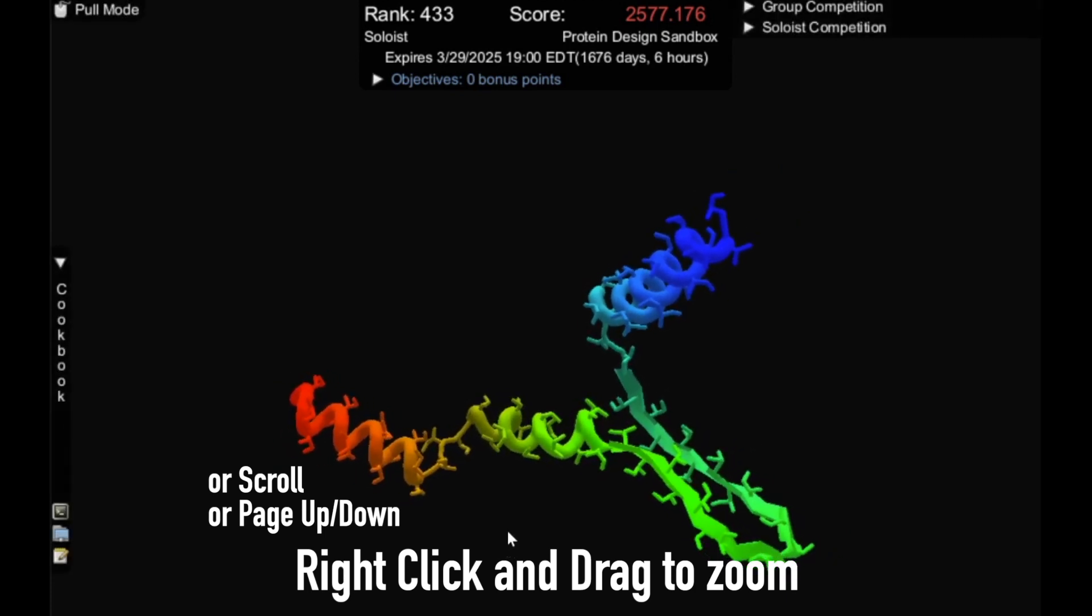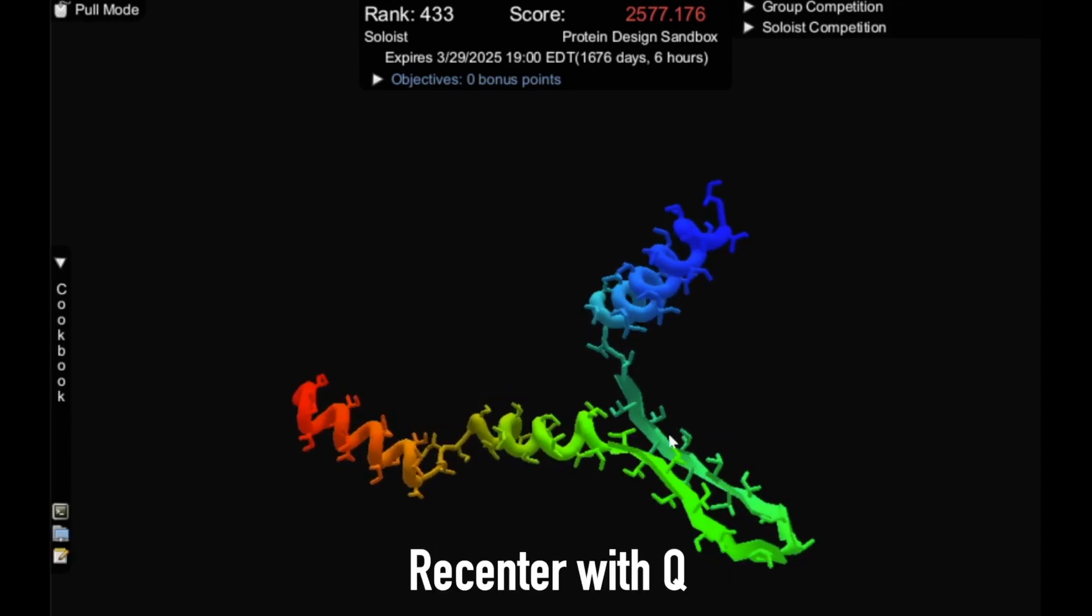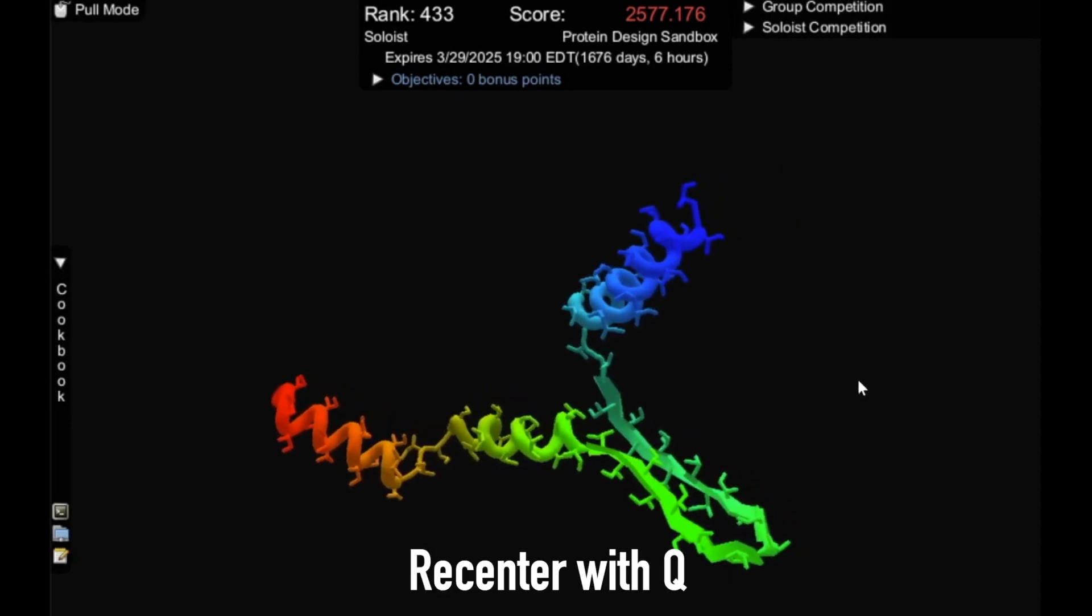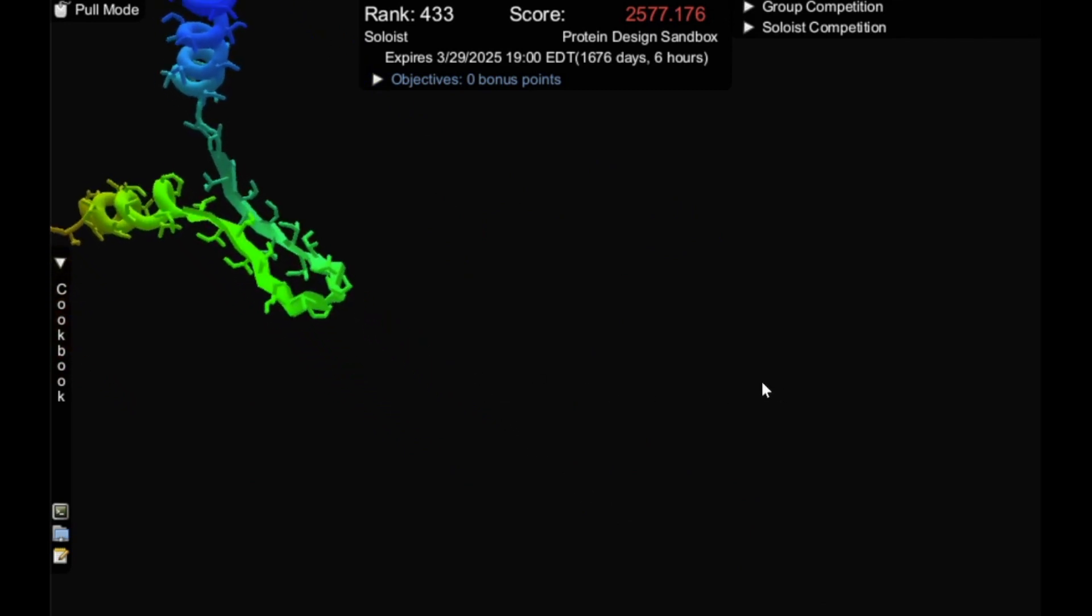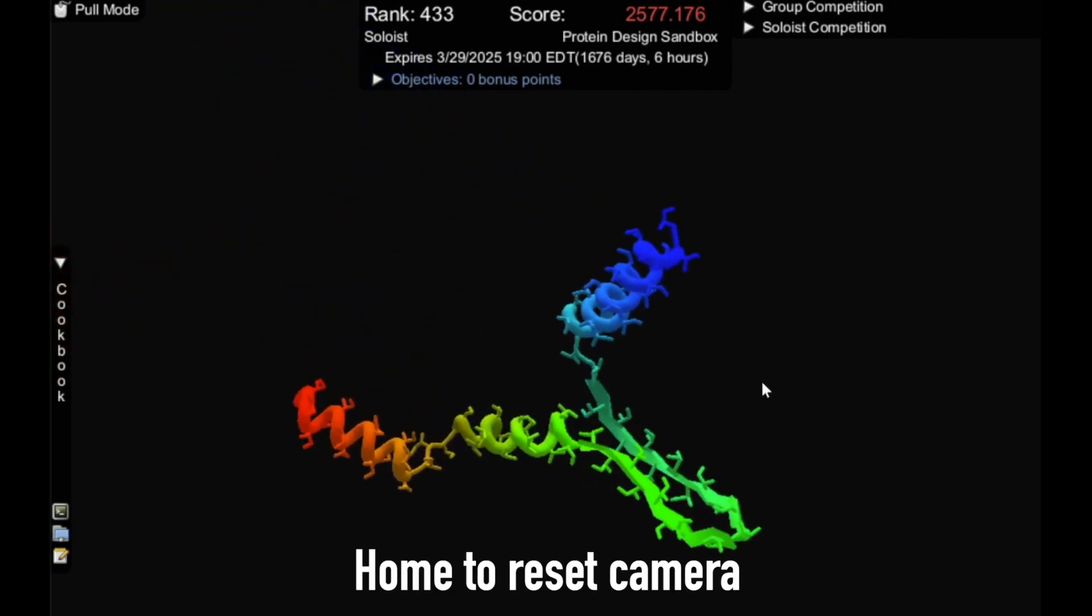You can change these controls in the general options. You can recenter your protein by pressing Q on the background, and if you ever want to reset the camera completely, press home to go back to its original position.